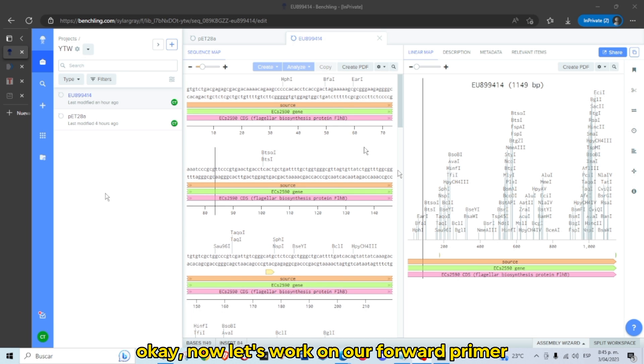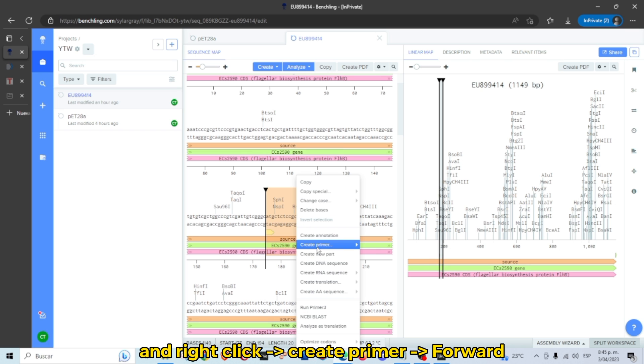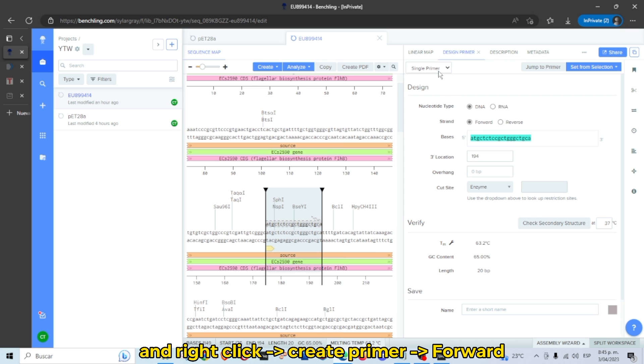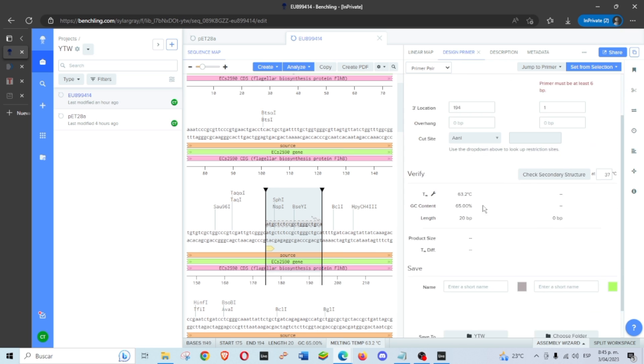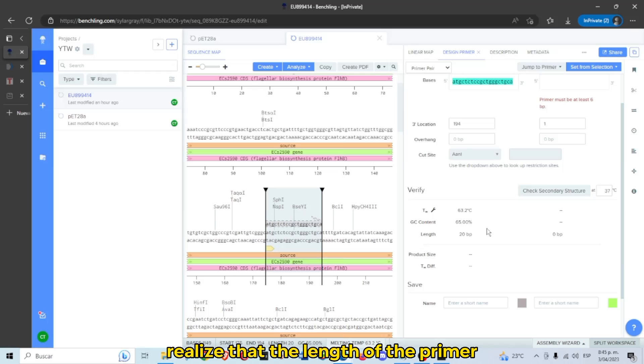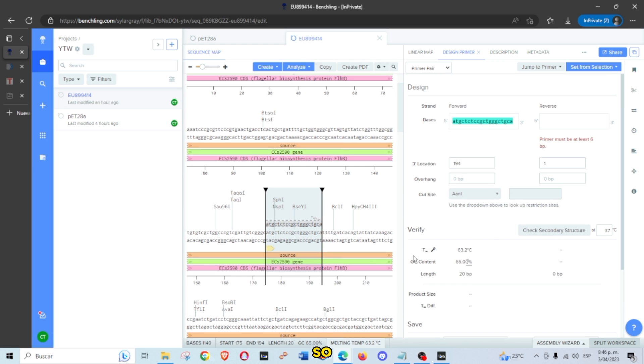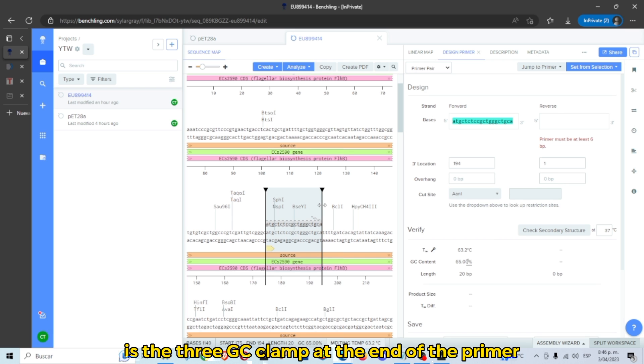Now let's work on our forward primer. Select 20 base pairs from the start codon, then right-click, Create Primer, Forward, and select Primer Pair. Here we can see the melting temperature, the GC content, and the length of the primer. The length of the primer must be 20 base pairs — that is the ideal size when designing primers.